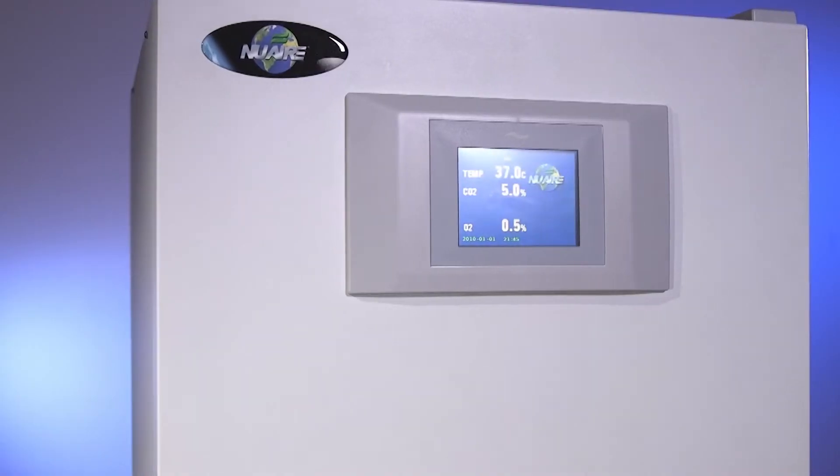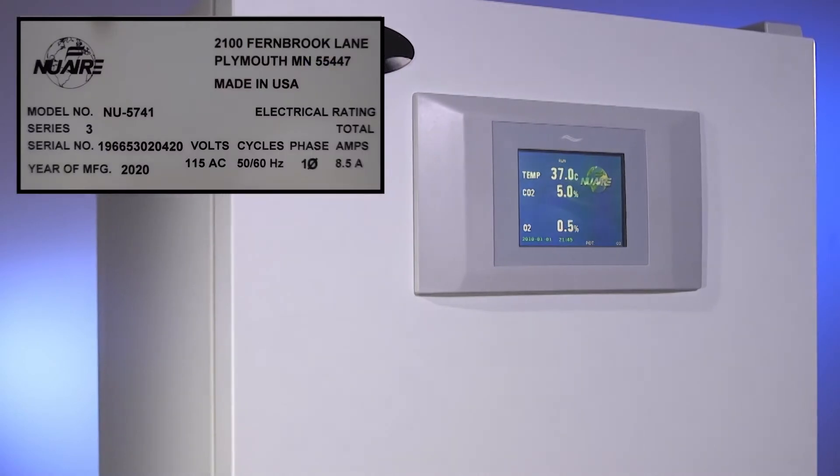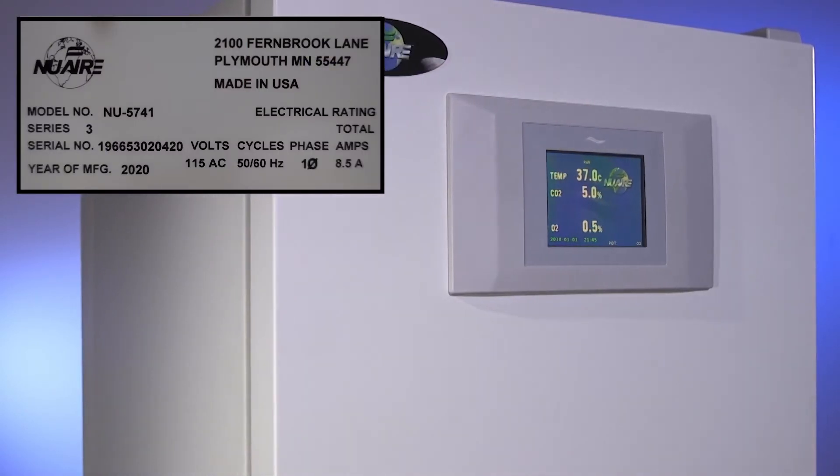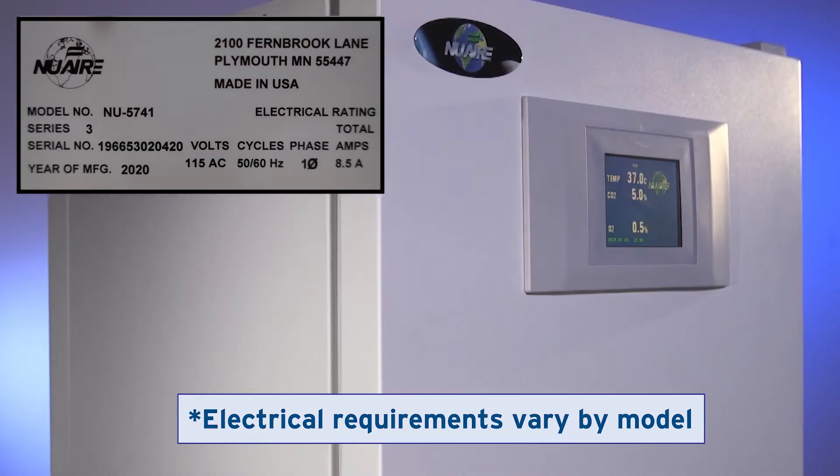Make sure a grounded outlet from a dedicated circuit that meets the requirements on the incubator data plate is close enough for the 6.5 foot or 2 meter power cord to be easily plugged or unplugged.